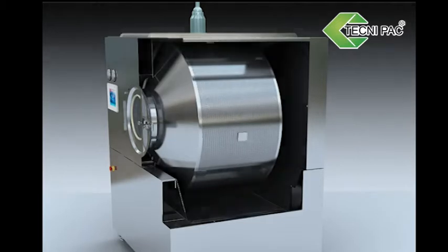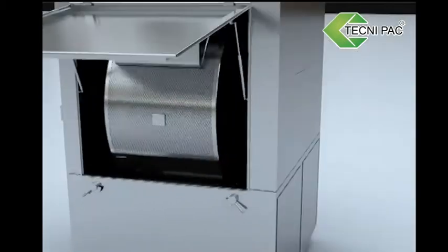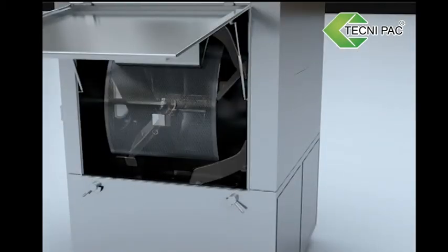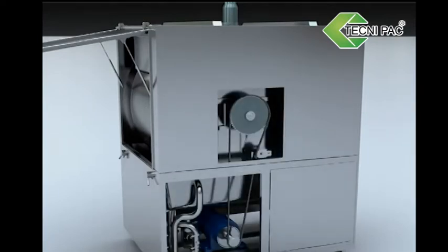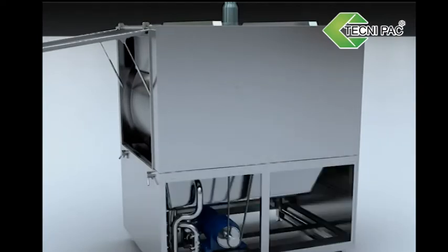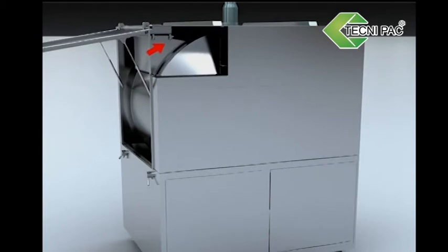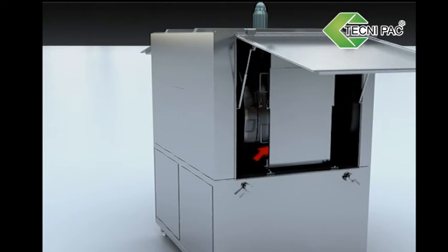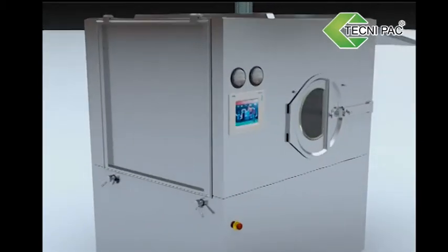Main Machine. It is composed of housing, film coating drum, streamline guide plate, explosion proof motor driving mechanism, cleaning tray, hot air intake, exhaust, outtake, and touch screen.